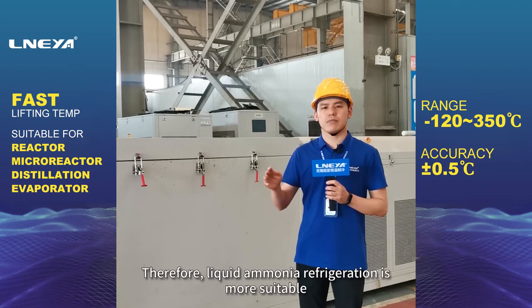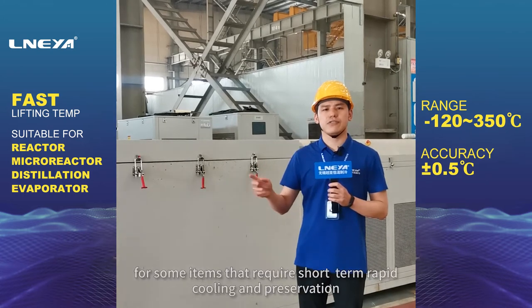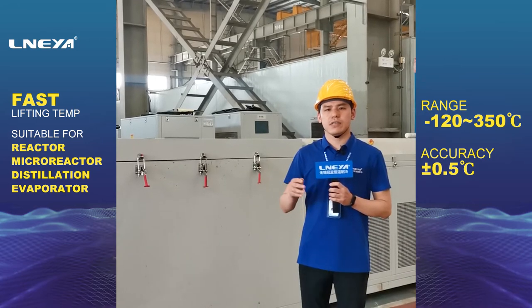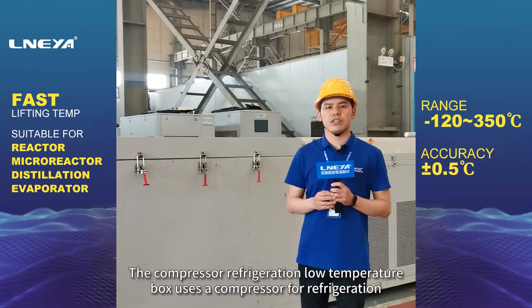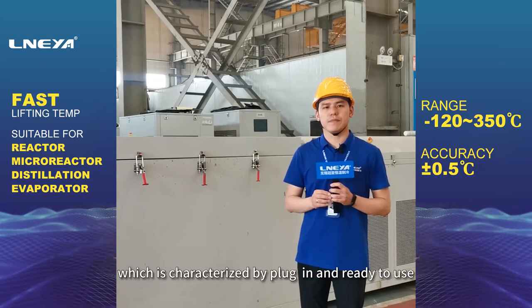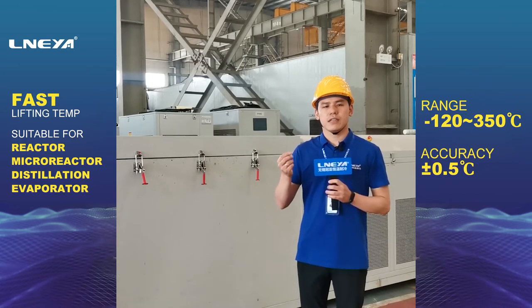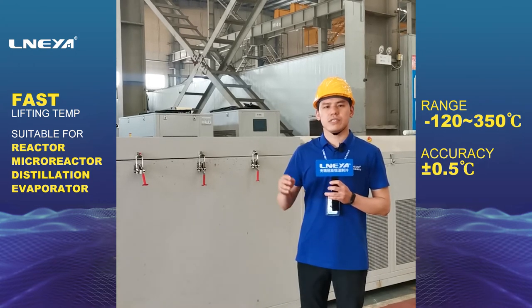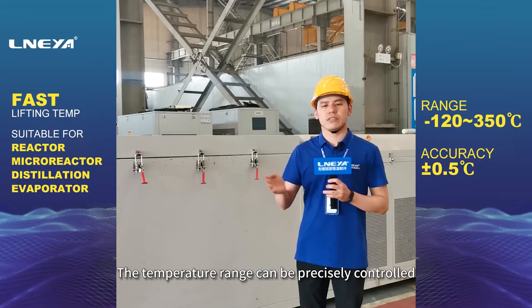Therefore, liquid nitrogen refrigeration is more suitable for items that require short-term rapid cooling and preservation. The compressor refrigeration low-temperature box uses a compressor for refrigeration, which is characterized by plug-in and ready to use, large storage space, compact structure, and easy operation. The temperature range can be precisely controlled.